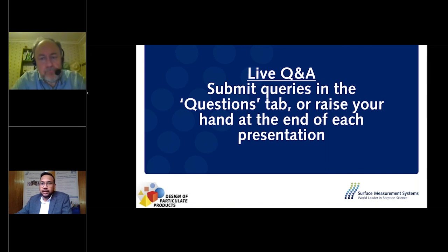Thanks a lot. The next one is how to quantify the number of OH groups present on the surface of solid phases and to access acidity constants. Okay, so let's start with the first question, number of hydroxyl groups. There is no reason why you cannot do titration type experiments inside an inverse liquid chromatography experiment.